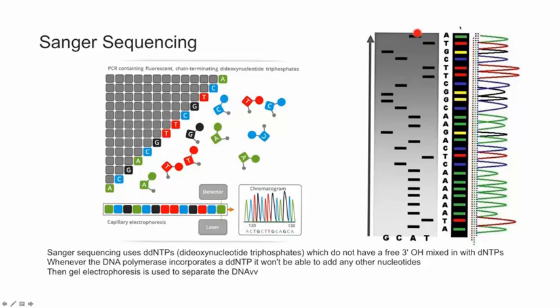But the capillary electrophoresis is actually able to separate it out much better because it's not read until the size actually comes down here. So it's actually able to separate them better. So you can easily get reads of 600 to 800 bases off of each sequencing reaction. So not only are you more efficient by being able to use capillary electrophoresis, and instead of having to use 4 lanes, only use 1 lane or 1 capillary at a time, you also get a much longer read out of them.